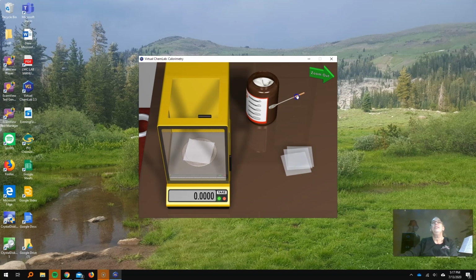You're going to have to go online and figure out its formula. And we got this number for naphthalene, 103.54 grams. And you're going to have to figure out the molar mass and the chemical formula. Go on Google and figure it out. It'll be easy to find. And then you'll know what the molecule looks like. So this should be pretty straightforward.